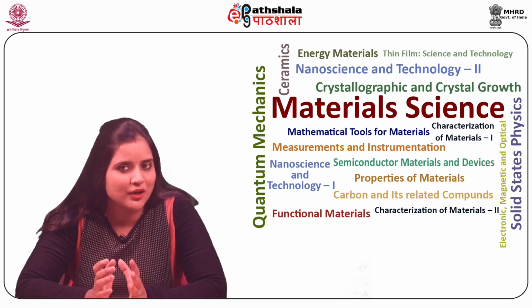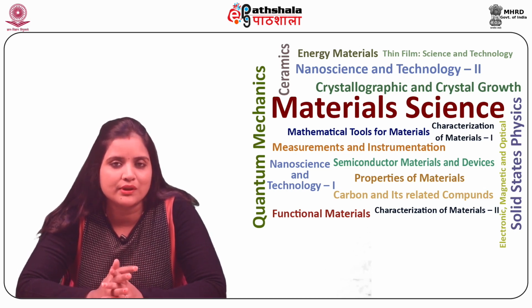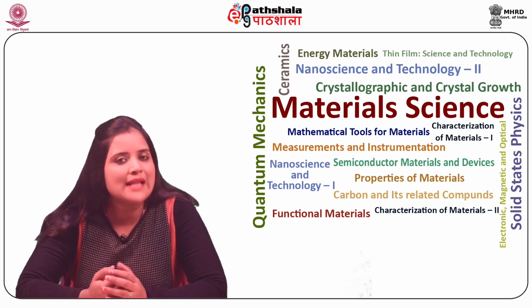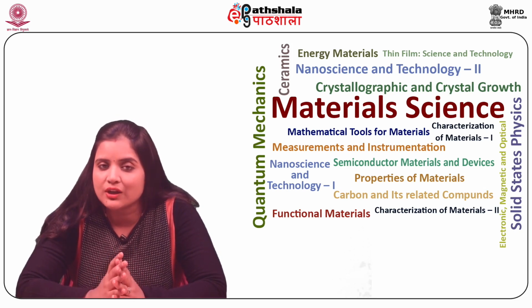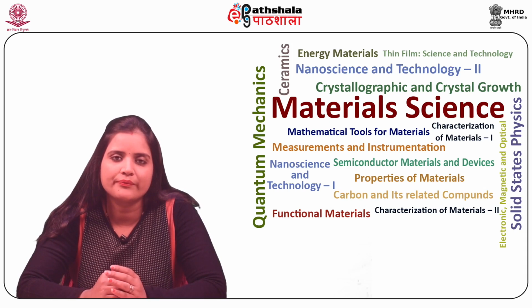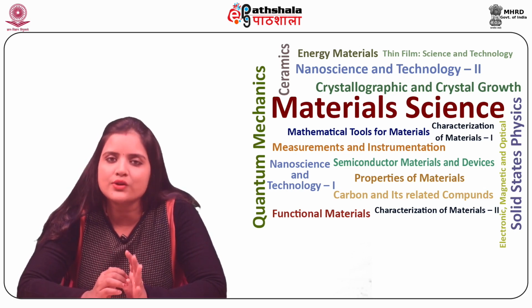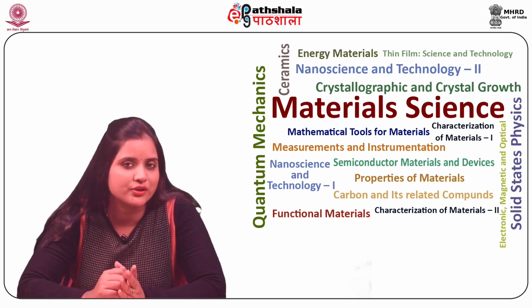The formation of an image using fluorescence is referred to as fluorescence microscopy. The setup could be simple, resembling an epifluorescence microscope, or complex like a confocal microscope that uses optical sectioning to obtain superior resolution of the fluorescent image. Eric Betzig, William Moerner, and Stefan Hell developed super-resolved fluorescence microscopy, bringing optical microscopy into nano dimensions.